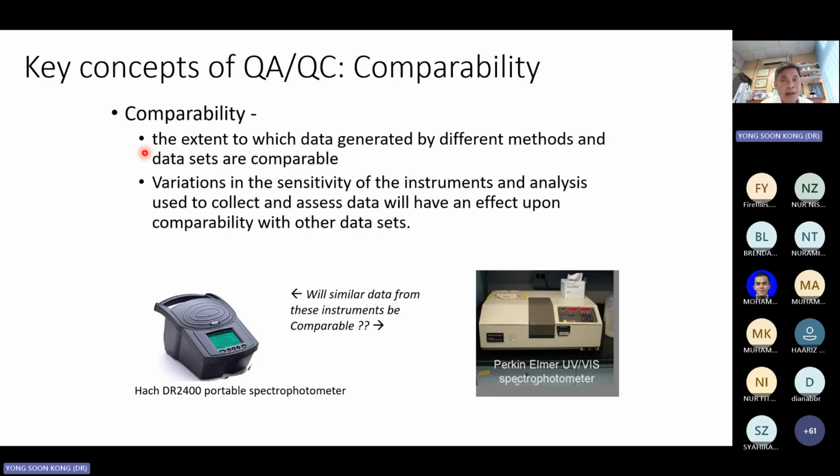But let's say you manage to contact DOE. If you manage to contact DOE and DOE has the water quality index previously from Sungai Tua, you can take that data, and once you finish your field trip and do the water lab analysis, you get the water quality index with all the data from each of the 6 parameters. You can actually compare with DOE's result. However, are we comparing with the same protocol? The answer is, it may not be.